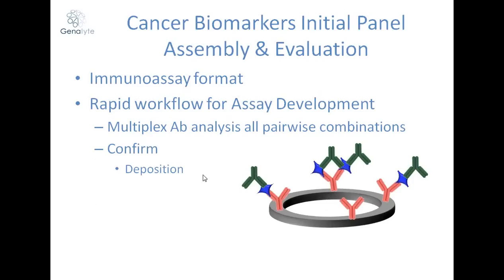It's a real-time assay, so we can actually monitor what's happening. We can see that the antibody is down on the surface. We can then confirm whether the antibody is actually binding its target ligand. And then we can test in all pairwise combinations the secondary antibody coming in to see whether it binds, how well it binds, and how robust a response it provides.